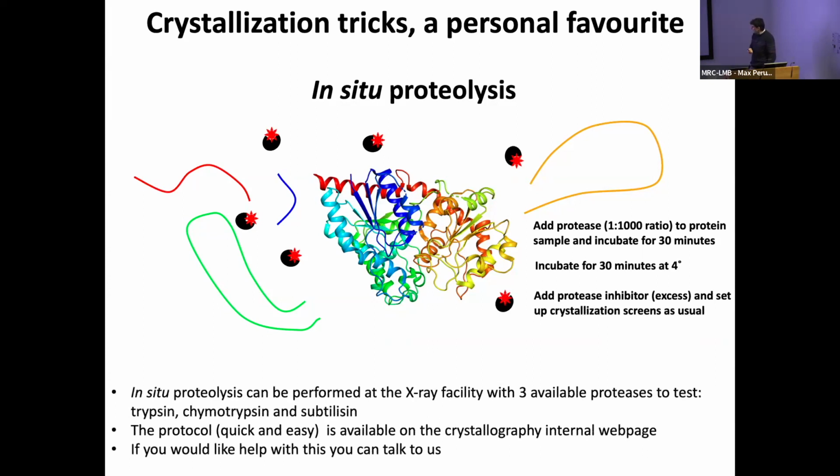So as I said, we have three available proteases. The protocol is very quick and easy. So if you'd like to try, just please let us know. But probably if you have a problem in crystallizing, we will suggest it to you anyway.